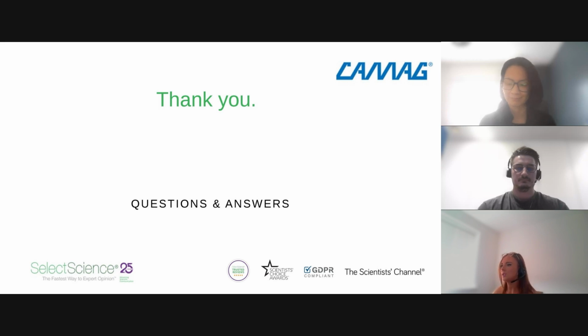The first question here that we have got is, how do you improve the separation of close peaks? I can answer this question. You have seen that we did some tests also without saturation, and without saturation, we succeeded to improve the resolution. So this can be one direction where you can go if you want to increase the separation.